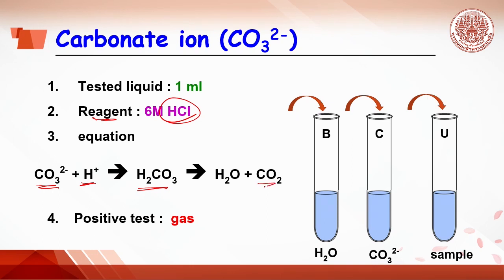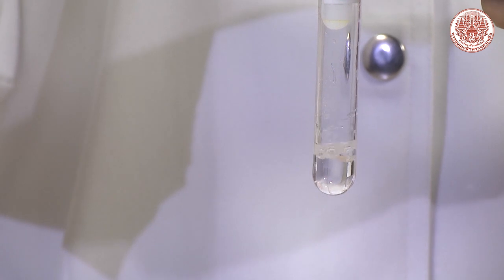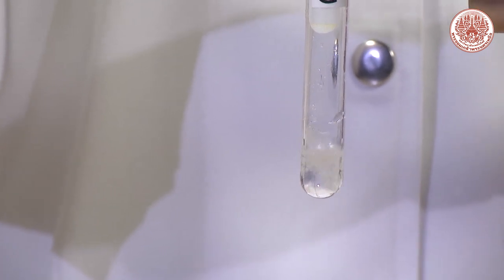It decomposes to get carbon dioxide gas. So, positive test for carbonate ion is carbon dioxide gas. Hence, in C tube, bubble will be observed. Where B tube, no bubble is seen.